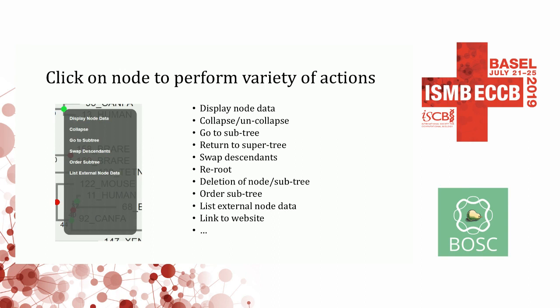You can also click on nodes and do various things, like display data on the nodes, collapse or uncollapse, go to subtrees, return to the supertree, delete a node or subtree, reroot the tree, and reorder and swap nodes. So there's quite a few things you can do here, depending on how it's configured and what data you have in the tree.